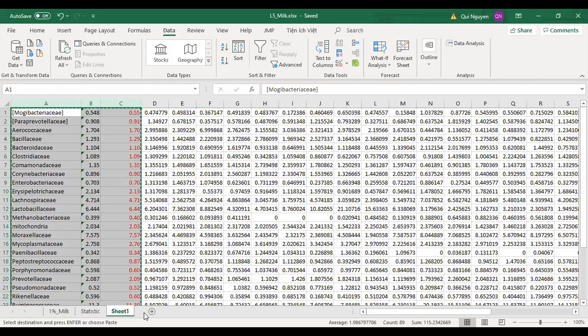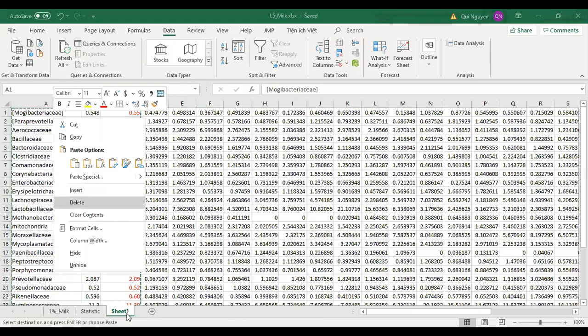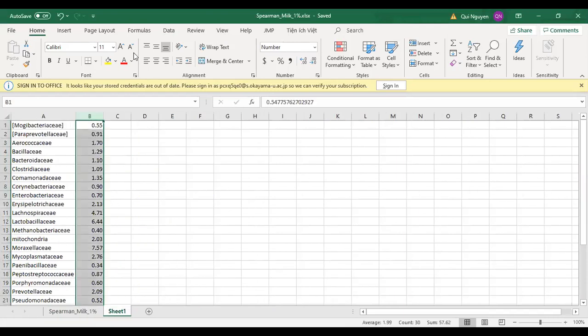Yeah. So what we need is, now you are seeing this file. Sorry, I will share. I didn't share with you, right? Milk. Okay.